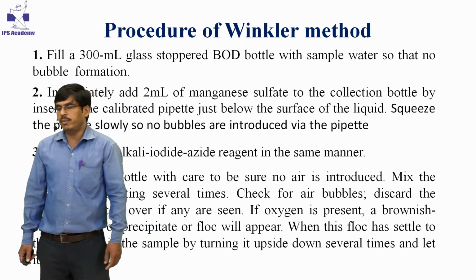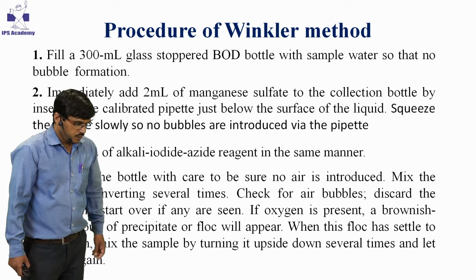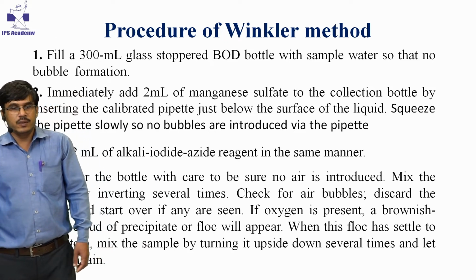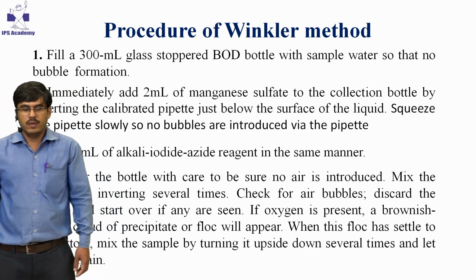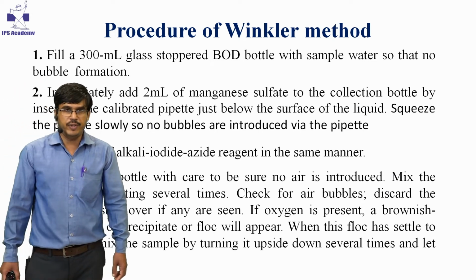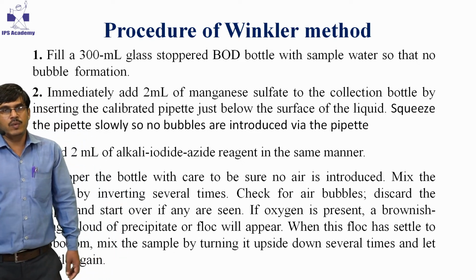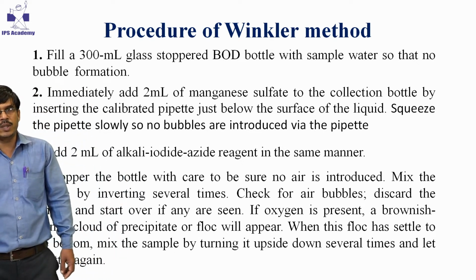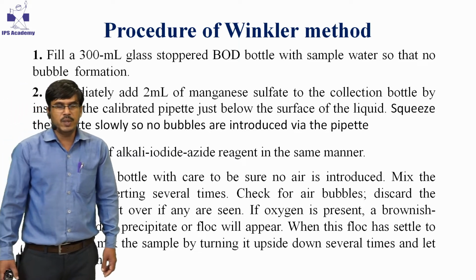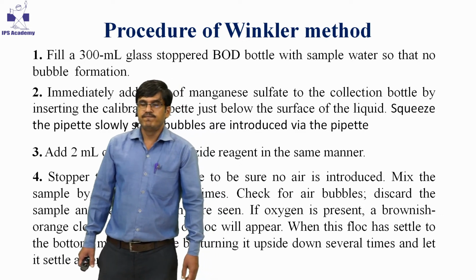Procedure of Winkler method. For collection of the water sample, we have to go to the field. There we have to fill the BOD bottle. The capacity of the BOD bottle is 300 ml.